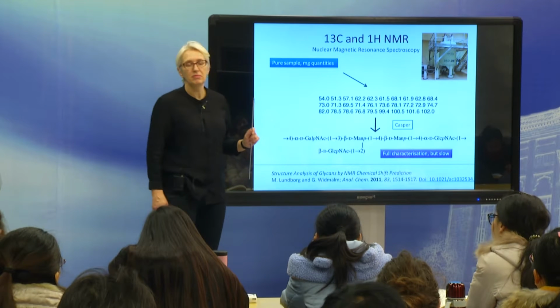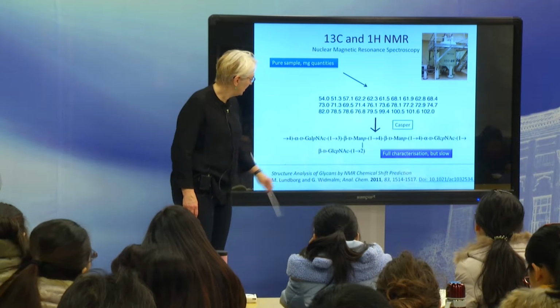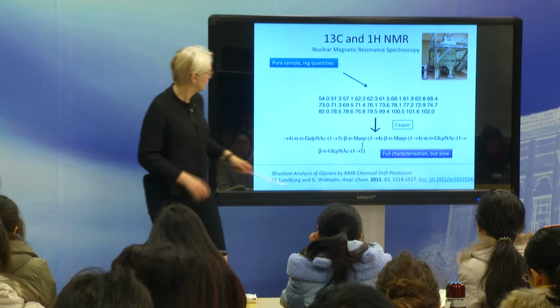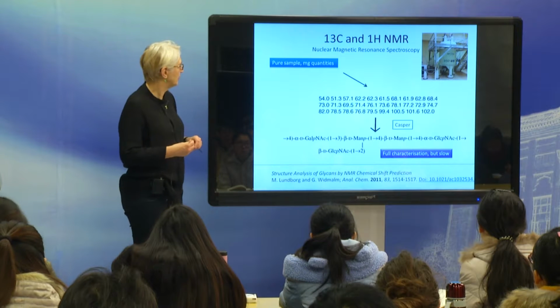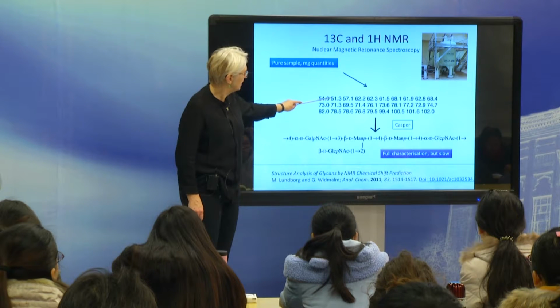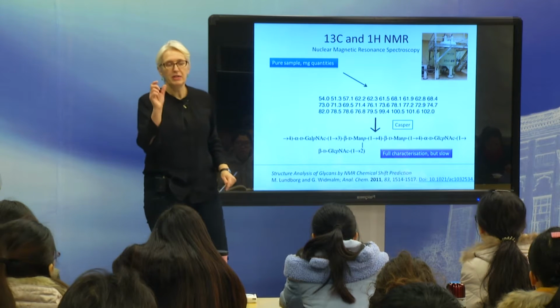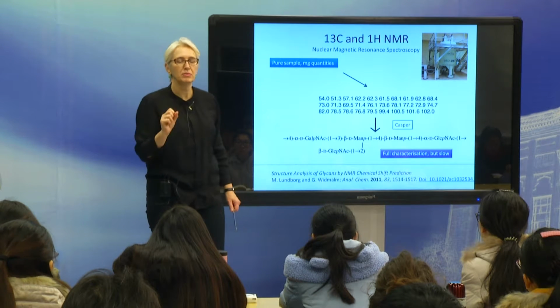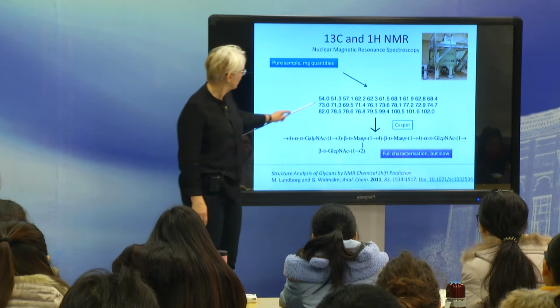But there have been a lot of advances made in the field in terms of structural elucidation. In particular, a colleague of mine, Göran Widmalm, has developed an automated assignment system for carbohydrates called CASPER, described here as an automated shift prediction for carbohydrates, which makes the elucidation somewhat easier. This paper describes an example where he does a carbon-13 analysis of a carbohydrate. What you get in NMR is chemical shifts for each atom. That's the beauty of NMR. Each carbon in your carbohydrate has a different chemical shift, and you can catalog that.